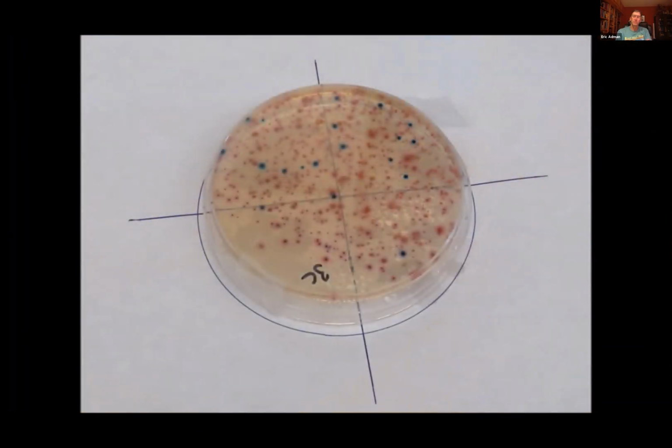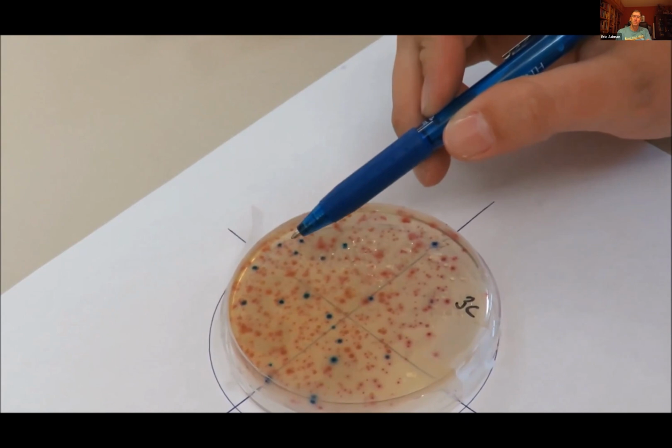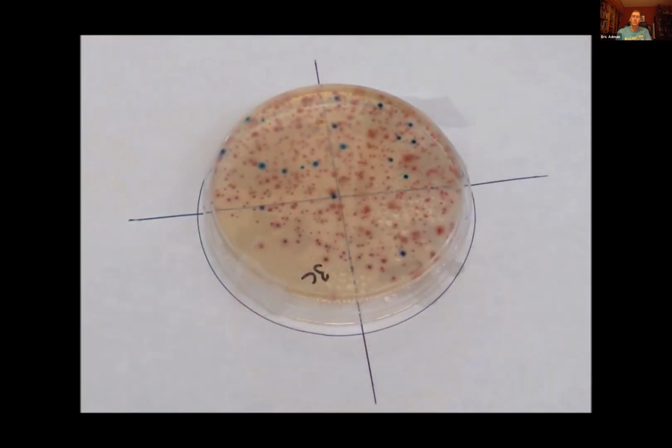When counting the number of colonies, it is helpful to use a white sheet of paper to split the plates into quadrants. Count all blue to purple colonies on each plate as E. coli. Do not count very small or pinpoint colonies smaller than the period at the end of a sentence. Count or estimate the number of all pink to dark red colonies on each plate as other coliforms.